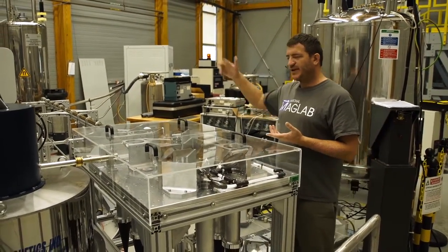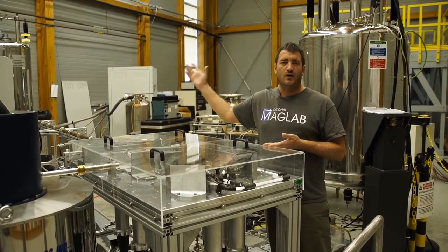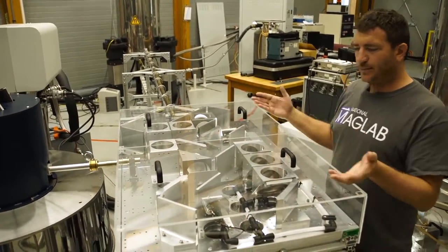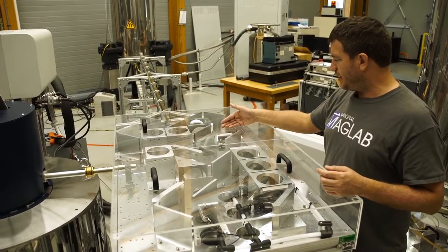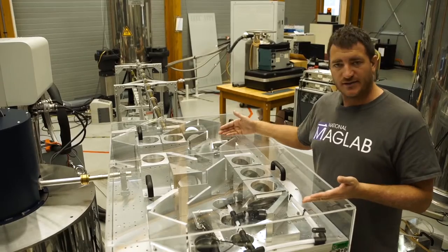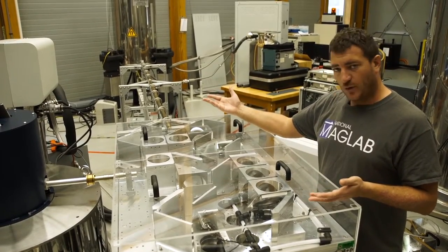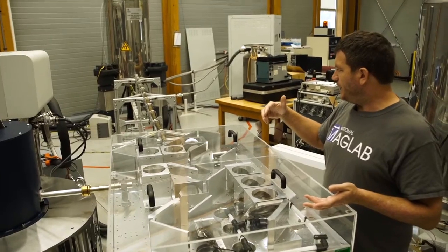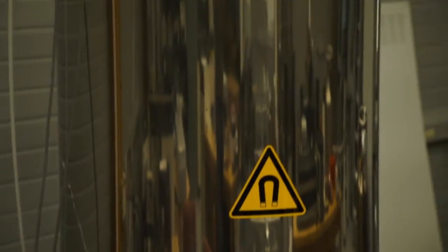Before the beam is sent out to the probe, on the MAS side we have a power meter that allows us to track how much power is actually going forward to the sample. After the power comes out of the gyrotron and moves through the beam splitter, following one side: it goes through a high-speed shutter controlled by the MAS DNP console, then through a series of attenuators for power control, then a pyrometer to track power going to the sample, and finally through about five meters of waveguide all the way to the probe of the MAS system and into the sample.